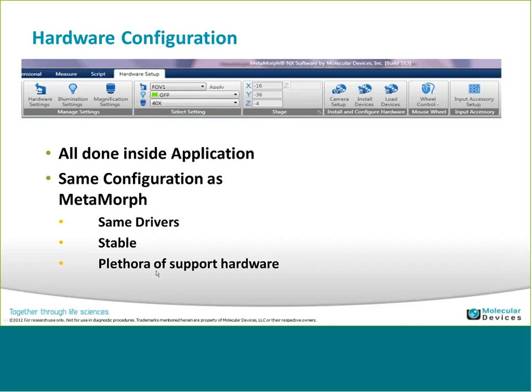Interactive, this will change to interactive. The ribbon is different for the different modes that we have, because there are different controls and configurations that you're doing, so they will be different. So that's how you determine it. First you determine the type of acquisition you want to do, and that changes the mode active context ribbon that's there.